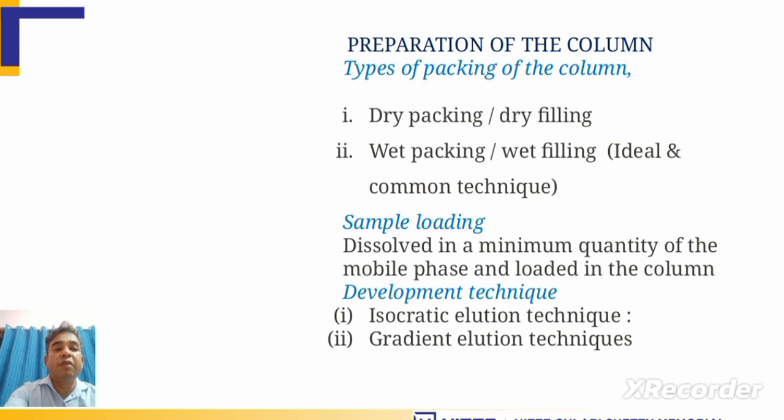And in wet packing, what we do is we dissolve the stationary phase in the mobile phase, and then we pack it so that the packing is proper and ideal, right? So generally the packing is done as wet packing, as there is an advantage of wet packing over dry packing, right? Then you need to load the sample.